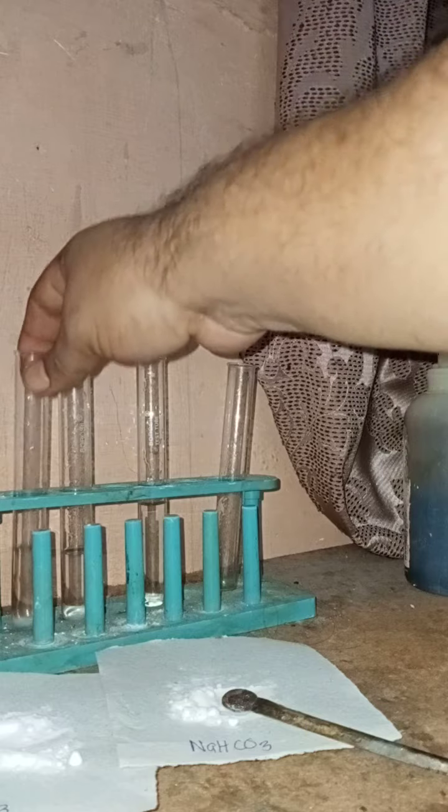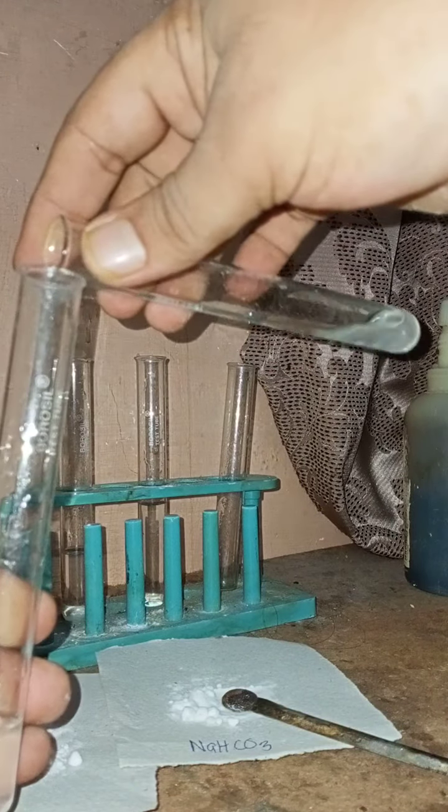In this test tube I am going to take the solution of sodium hydrogen carbonate, and to the sodium hydrogen carbonate now I am going to add the acid that we have prepared. You can see how the reaction takes place.